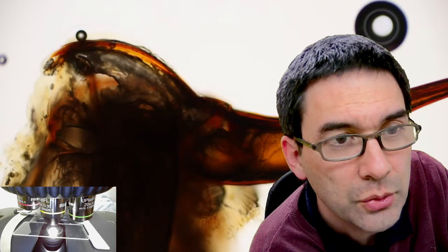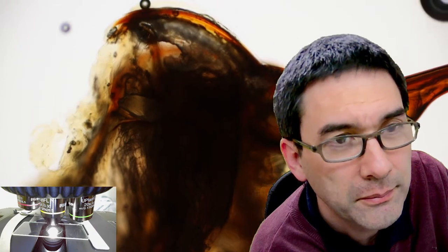But again, I don't know, maybe some of you are more into insects and bees and know a little bit more, but I'm wondering why there is no hook on here. Or maybe, and it's connected to a gland, the poison gland, of course. But on the other hand, look how pointed it is. That's a scary looking thing.